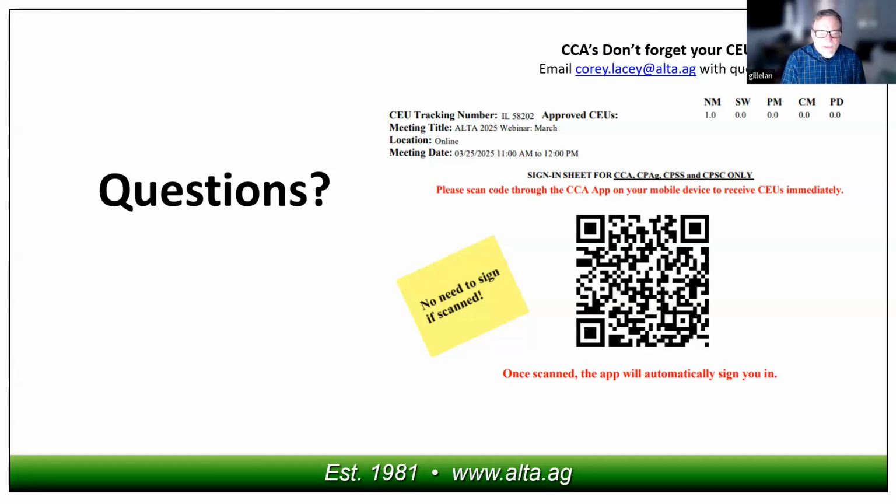The second half of the question was a nebulizer recommendation? Yeah, I mean, just consider it. I know that several labs hear from their ICP partner, hey, you're having problems with plugging, maybe try this nebulizer versus that nebulizer. So without highlighting a specific product, what are some considerations labs should be thinking about when they're looking at nebulizers, or maybe testing new nebulizers?